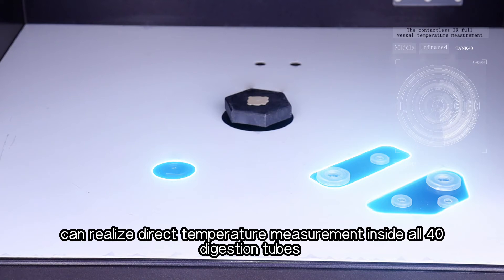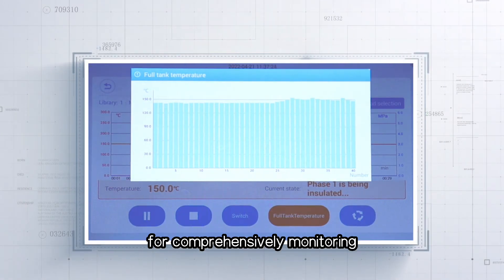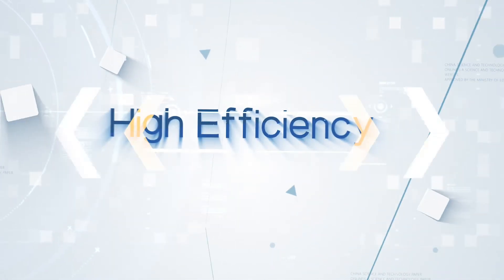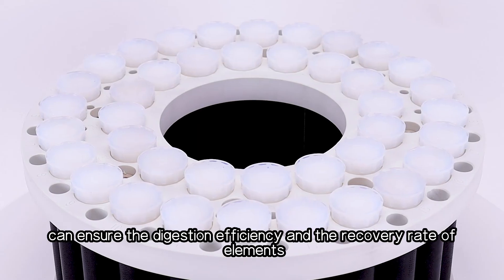The contactless, full-vessel temperature detection can realize direct temperature measurement inside all 40 digestion tubes. Each digestion vessel's temperature and temperature rise curve can be viewed for comprehensive monitoring, ensuring safe and comfortable operation.